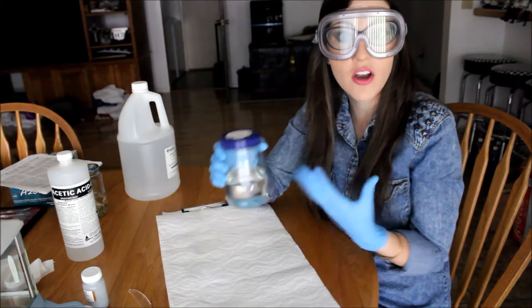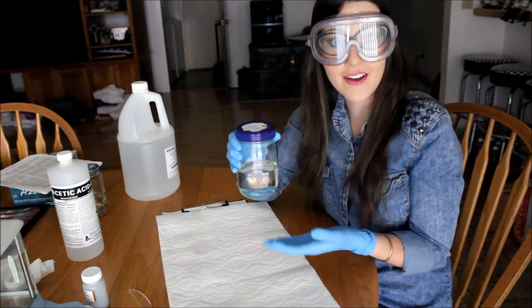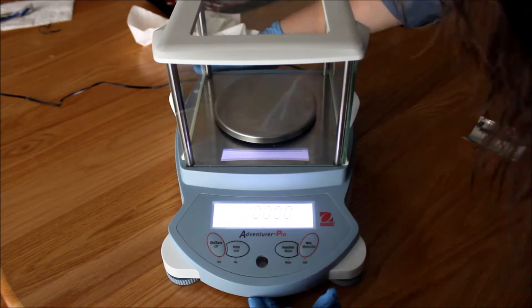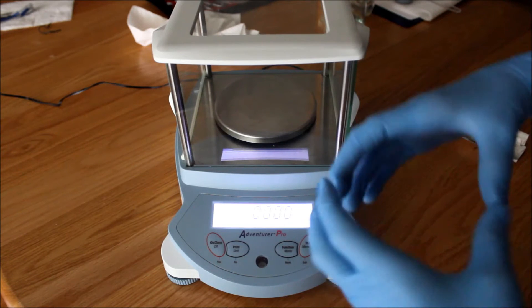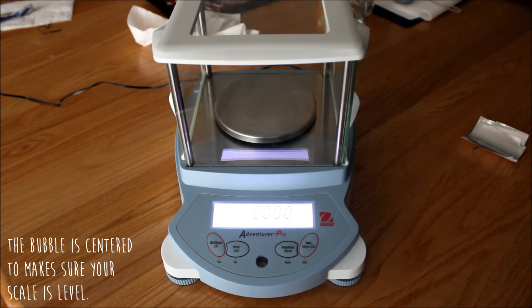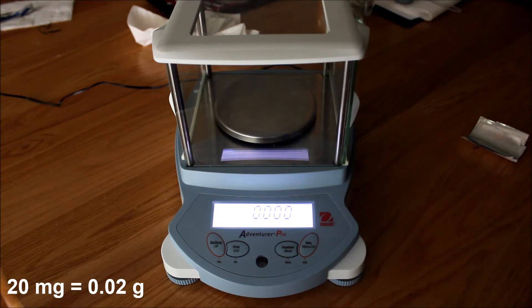Now that we have finished preparing our solutions with the 3 parts ethanol and 2 parts glacial acetic acid, we are going to be measuring out 20 milligrams of the Alcian Blue powder and just adding it in and mixing. What I was just doing was adjusting this little bubble right here — there is a hole and then there is a little circle with a bubble in it, and you want to get the bubble in the center so you know that your scale is on a flat, balanced surface. Since this scale is in grams, I am going to be measuring out 0.02 grams of Alcian Blue.